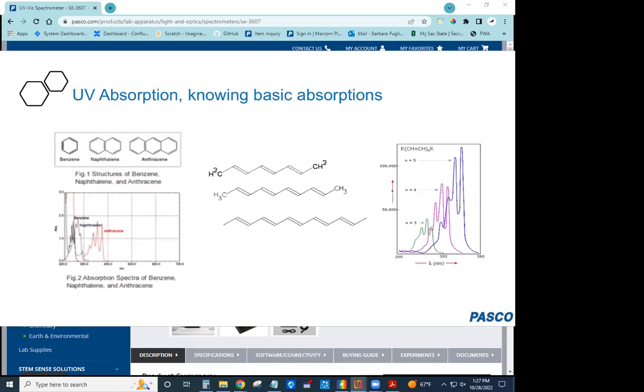The 2 concepts that I'll just relate to you: if they have a benzene ring or a 6-membered ring that has double bonds at every other place, on the very left you'll see a sort of black looking, I think actually it's dark blue looking spectra, and that's right around 250 or so that absorption occurs.